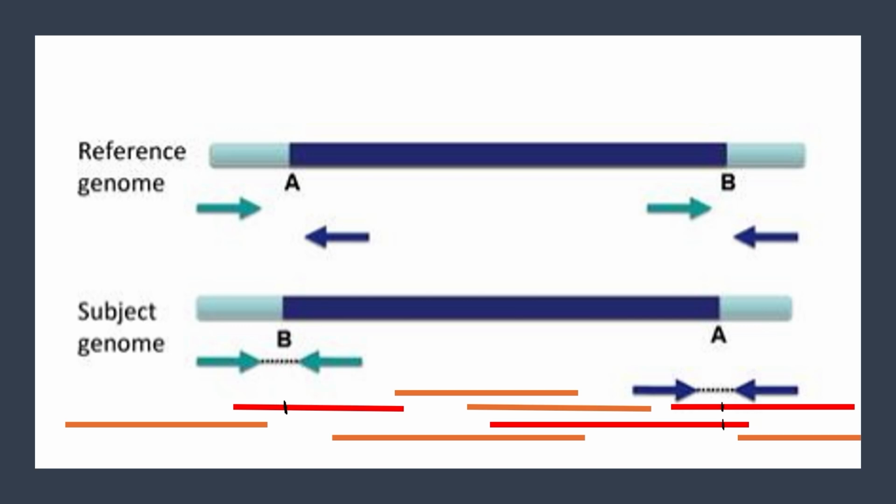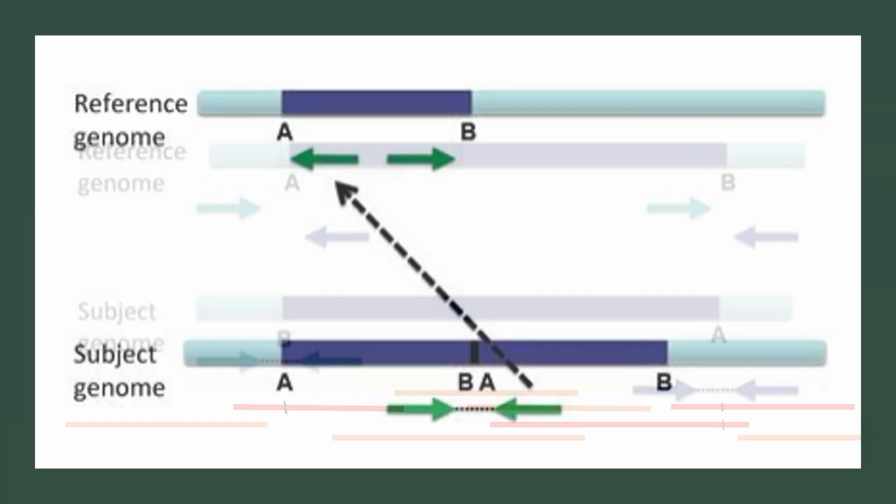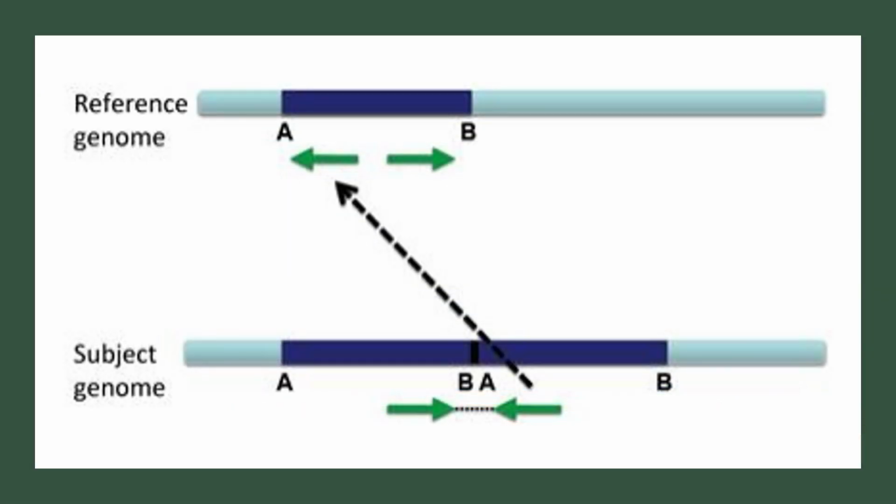But it is not good to hide soft-clip bases when you are looking for structural variants because the soft-clip bases will show you where the breakpoints are and help you understand your structural variant better. I will demonstrate all of this in IGV after we conceptualize some of the other types of structural variants and how IGV distorts them to force alignment to the reference genome.